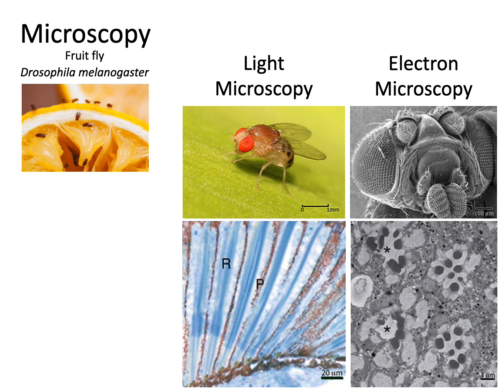And you'll note that the light doesn't need to pass through the specimen in order to use this technique, right? Light here is being cast down from on top of the fly, and the light is striking the fly, and the light is striking the leaf, right? And then we're visualizing that through a lens.